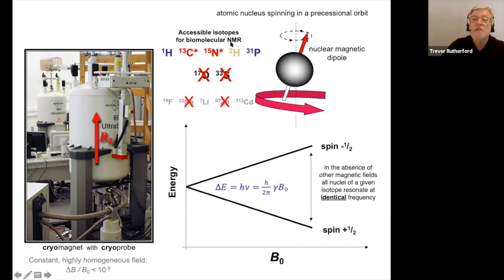I should say we can also do some labeling with deuterium, but that's used not to see something that you can pick up by NMR. That tends to be a technique for silencing the signals from the proton NMR. So we can incorporate deuterium to silence stuff. It's also worth saying there are no NMR usable, NMR friendly isotopes of oxygen or sulfur.